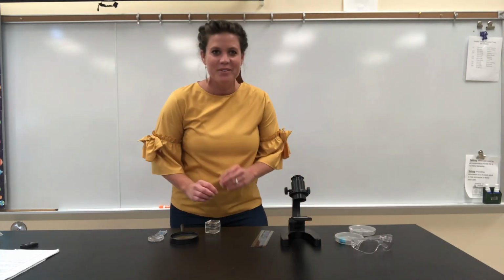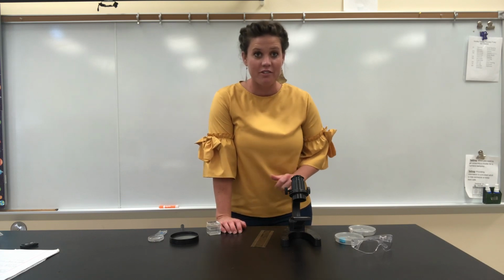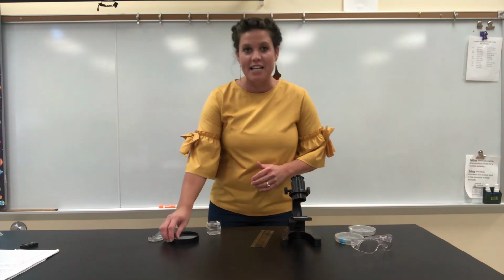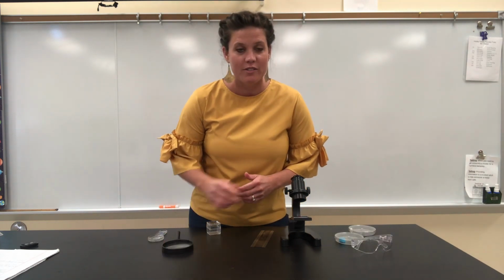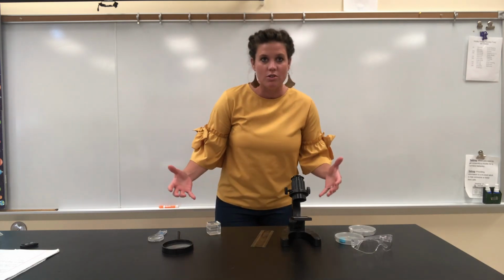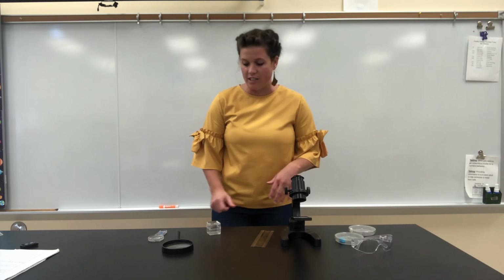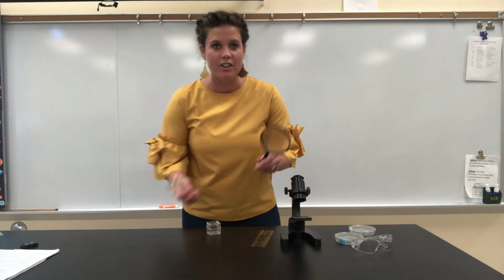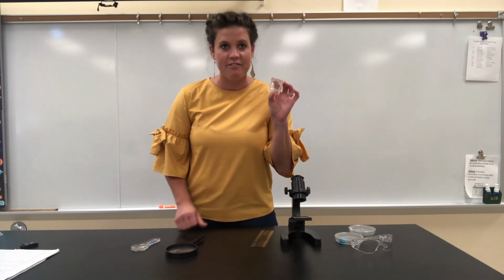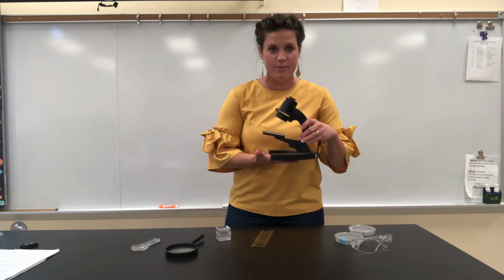Graders. Today we're going to learn about tools used for observing things. Observing means looking at closely. You've already had an assignment where you observed something outside and you described it for me. These are some tools you could use to help you make some observations. The tools we'll be using in 5th grade science are hand lenses, a magnifying box, and a microscope.